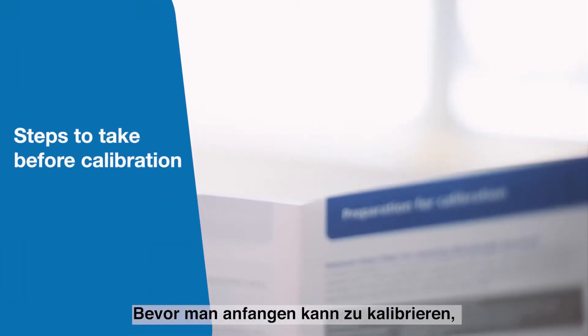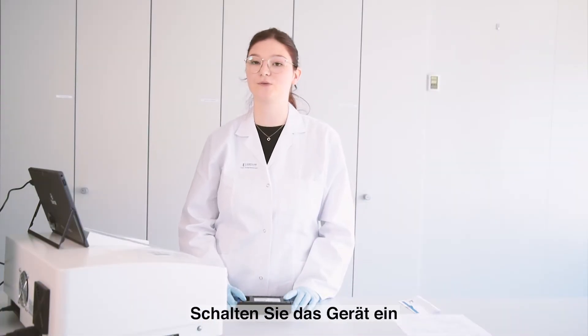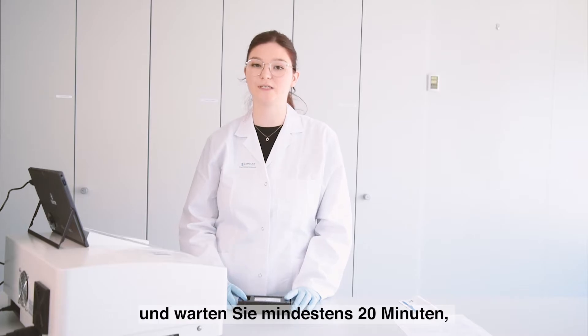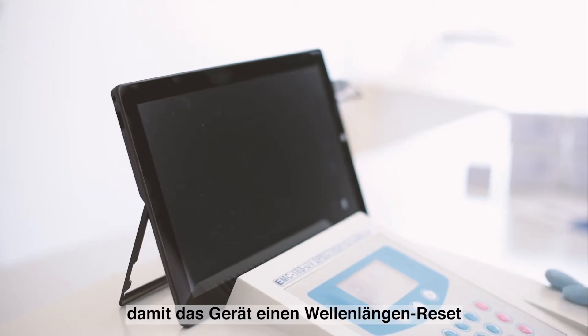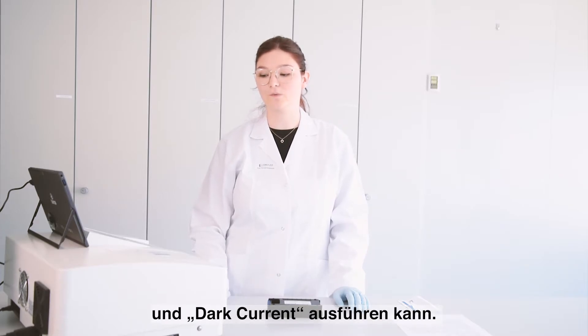There are several steps to take before the calibration. You first need to switch on the instrument and let it preheat for at least 20 minutes, because during this time the instrument is executing a wavelength reset and dark current measurement by itself.